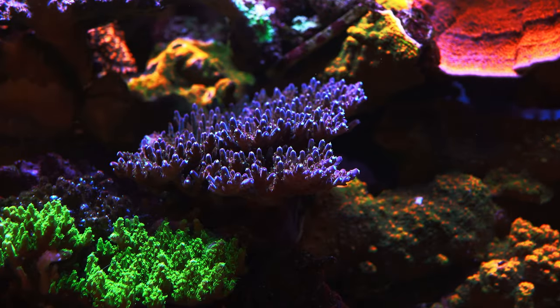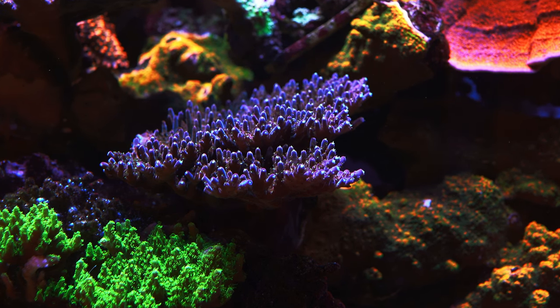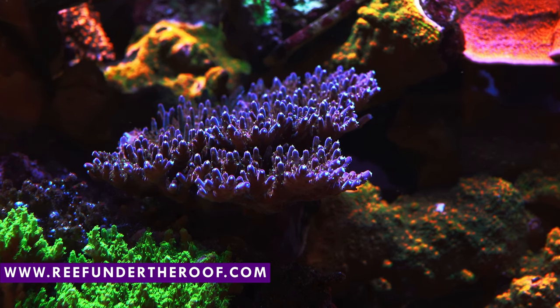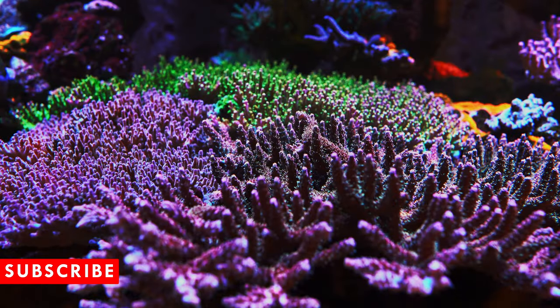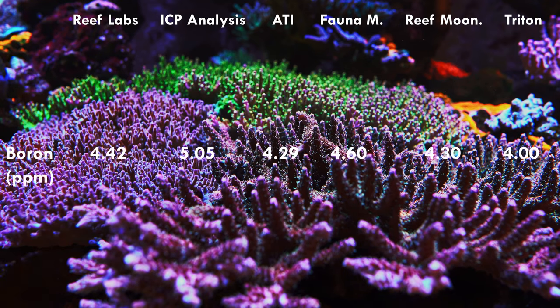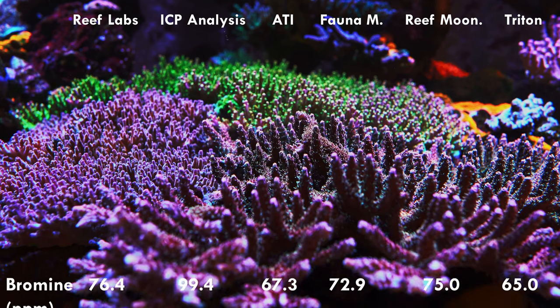All right, with all that out of the way, let's get into the meat and potatoes. When I went over the results from all the ICP companies, I decided to split them into two groups — one group where most ICP companies are agreeing on the value, and another group that's more complicated where some match and some are completely off. I'll read the ones all companies agree on first. Boron: Triton says the lowest value is around 4, ICP Analysis says around 5 — all others are kind of in between, all good. Bromine: most ICP companies agree it's somewhere between 65 and 99, all optimal.